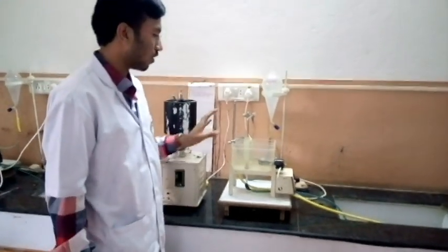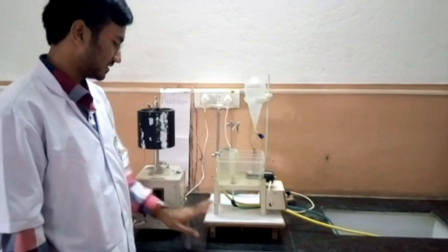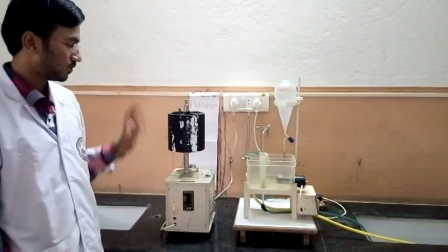The student organ bath consists of two systems: the organ bath itself and the rotating drum, which is the second component.